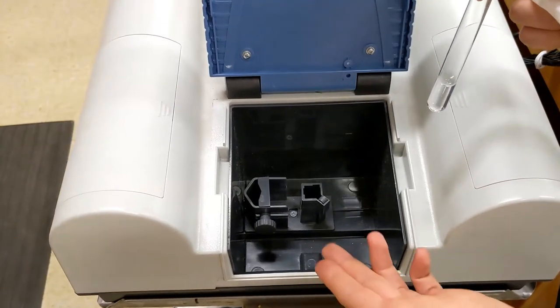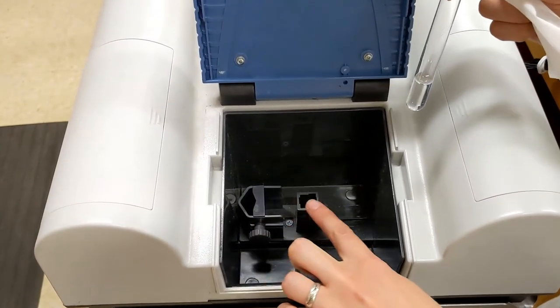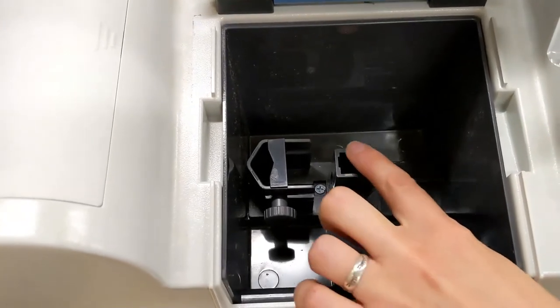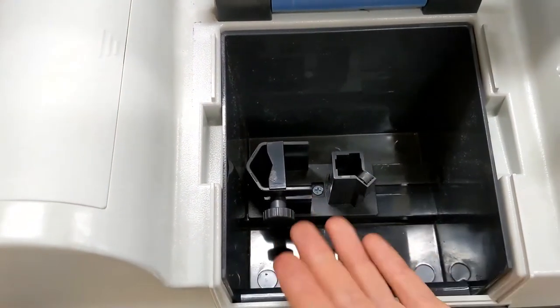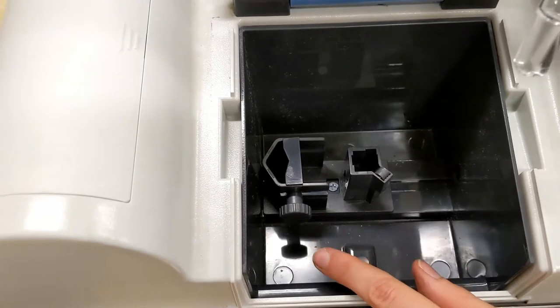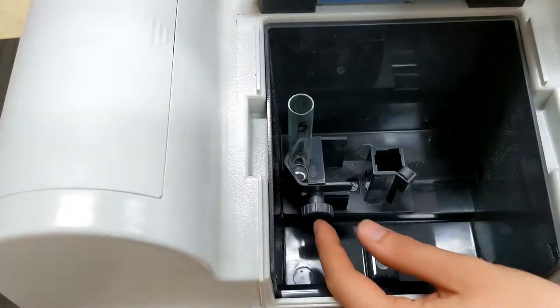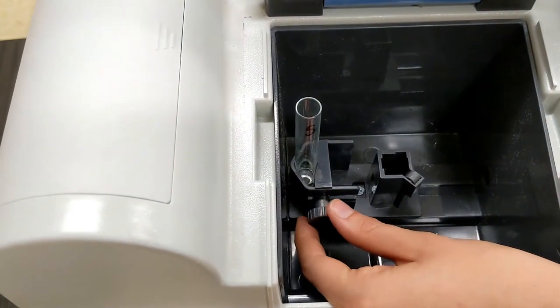On this machine there are actually two areas where you can put your solution. There is a square chamber for standard cuvettes, but we can also put in tubes, which is what this slot is for. This machine is pretty versatile because you can accommodate different size tubes by adjusting this fitting.